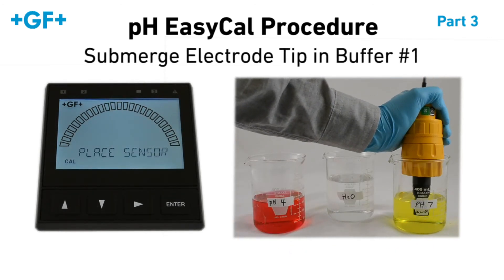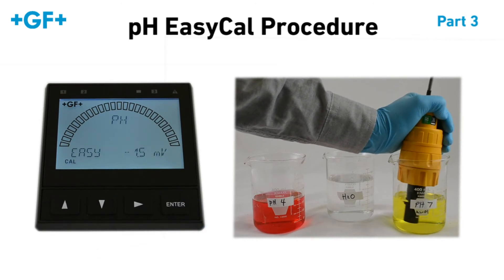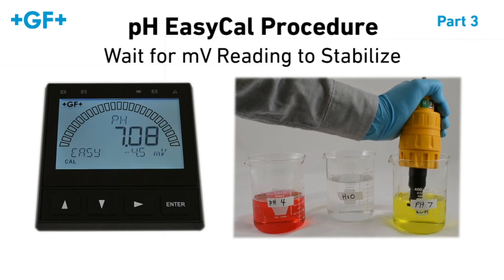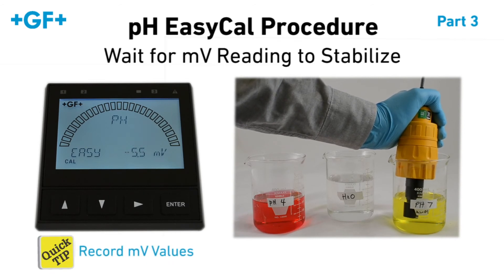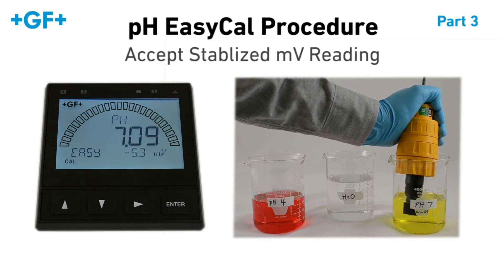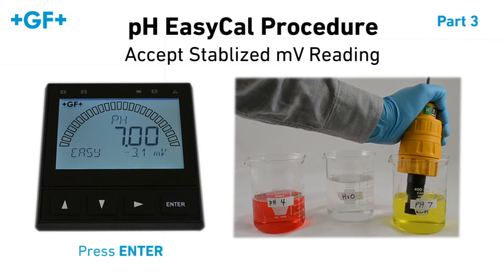Submerge the electrode tip in the first pH buffer and press Enter. You may have to wait approximately 30 seconds for the millivolt reading on the 9900 to stabilize. During this time, record the millivolt values — this information is valuable for troubleshooting. Once the millivolt value has stabilized, press Enter to accept it.